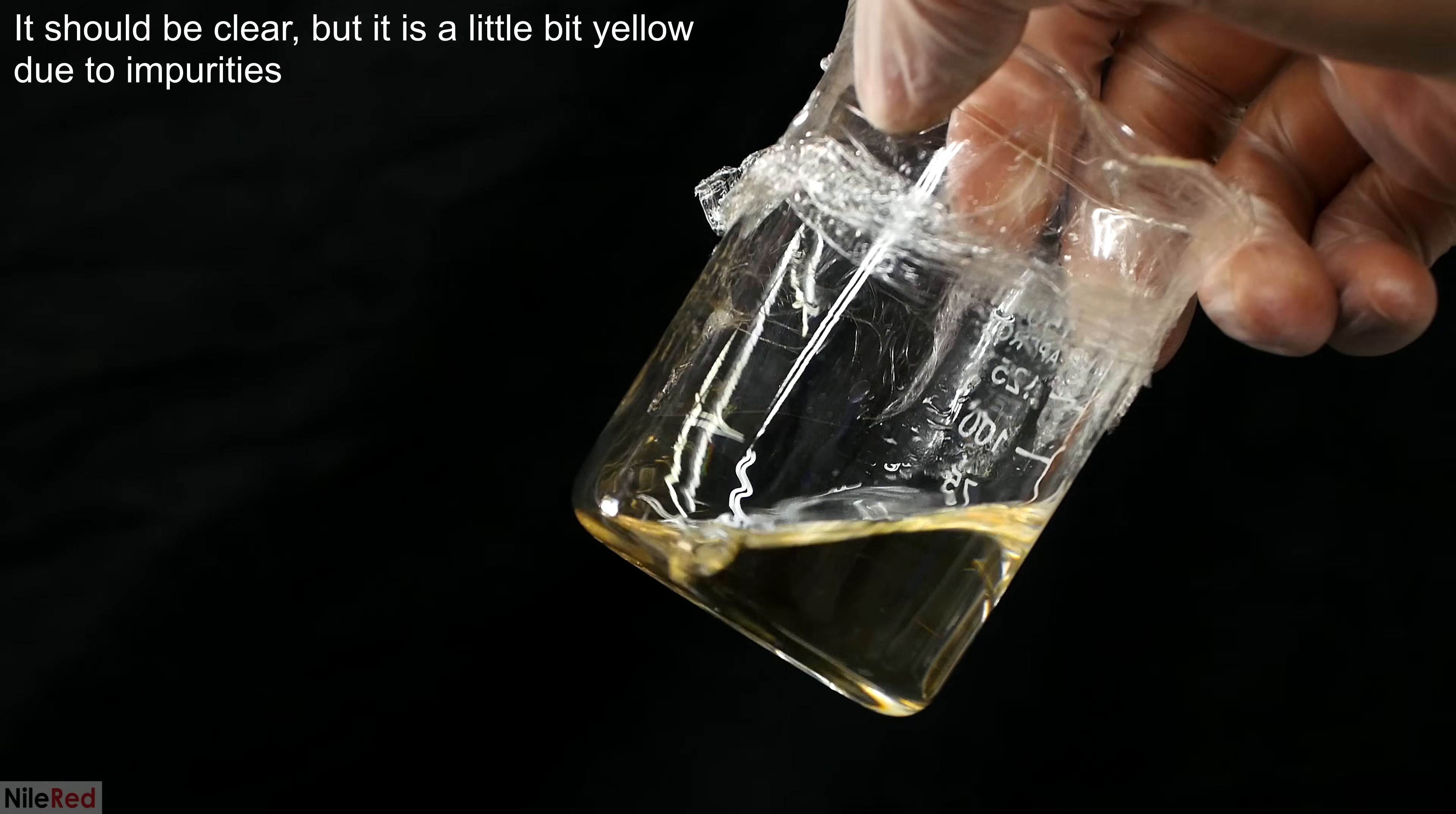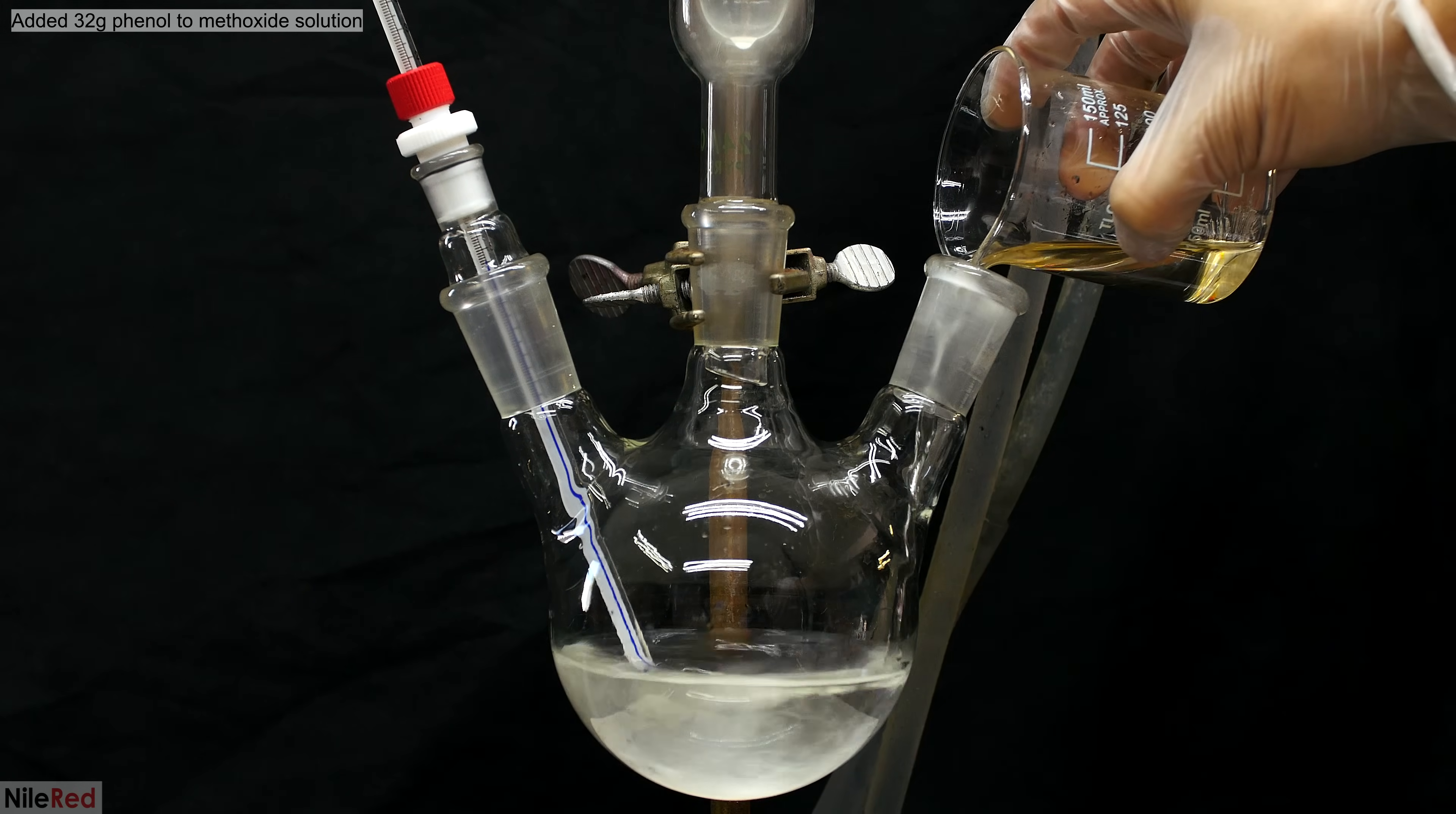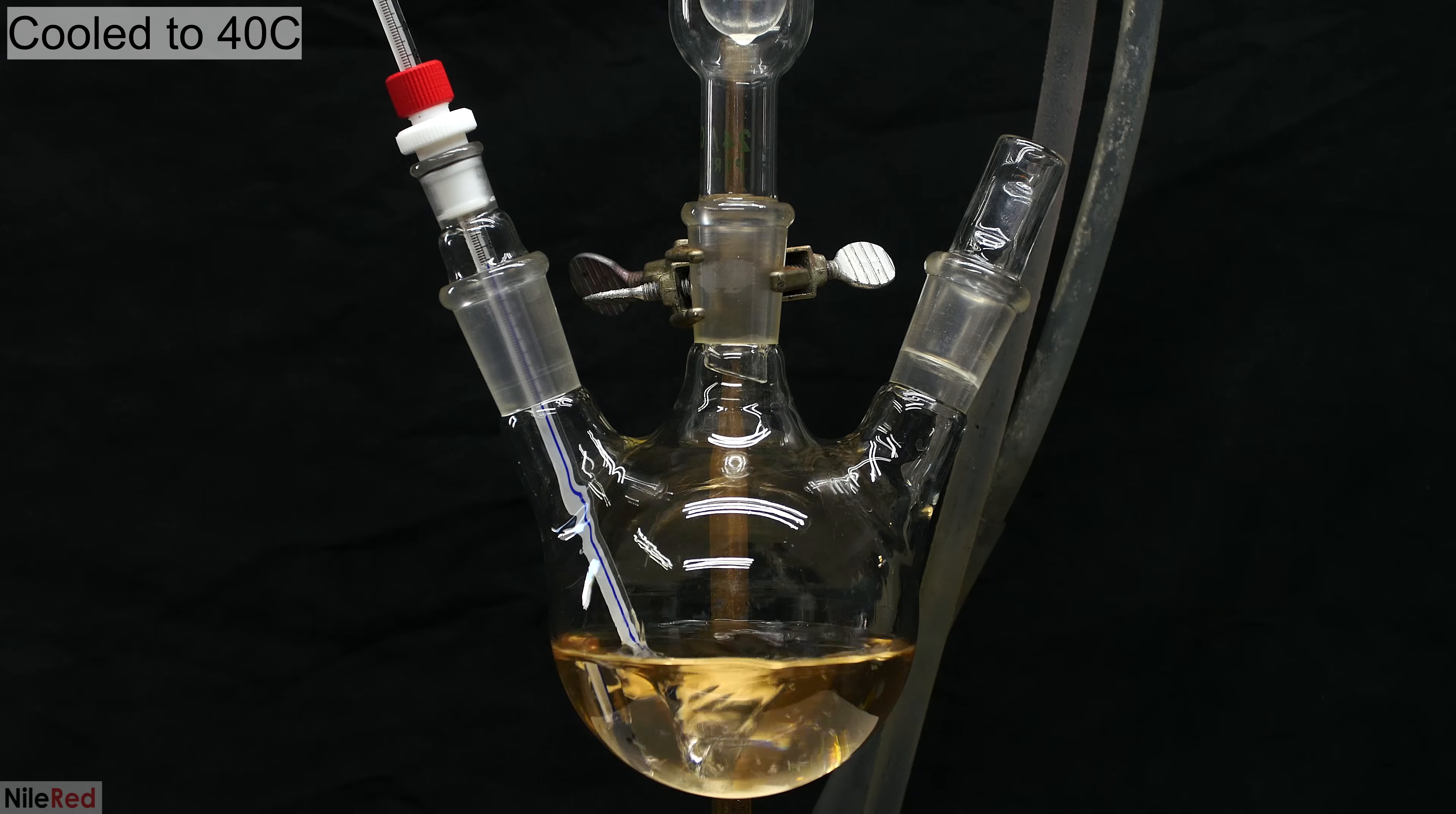It only takes a few minutes of blasting the phenol with the heat gun to be left with a nice clear liquid. When I come back to the apparatus, the temperature is below 50, so I go ahead and add the phenol. All 32 grams of the phenol was added in at once. You can see here that by melting the phenol, it was a lot easier to add because we simply had to pour it, and it dissolves much quicker in the methanol. I stirred the solution for several minutes and I waited for it to cool down below around 40°C.